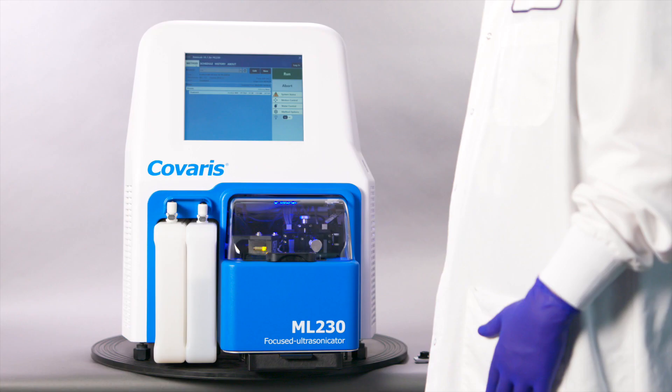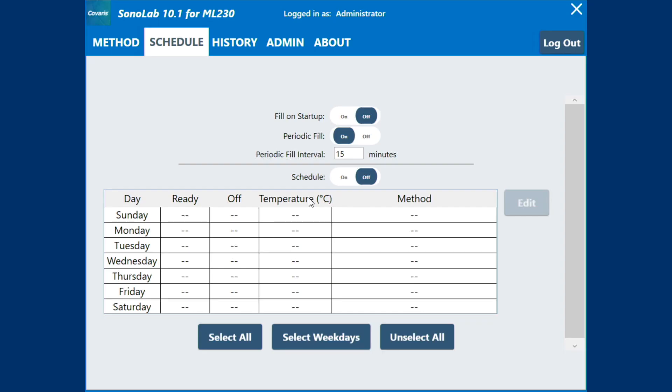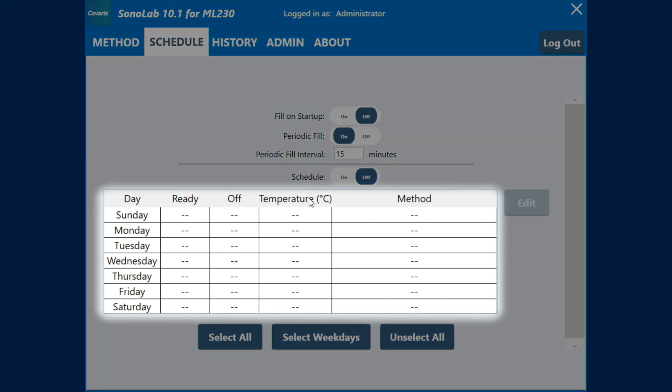If your instrument will be idle for an extended time, such as overnight, you should make sure to shut down the instrument. You can also use the scheduling feature in Sonolab to have the system automatically drain the water bath and shut down on specific days of the week.